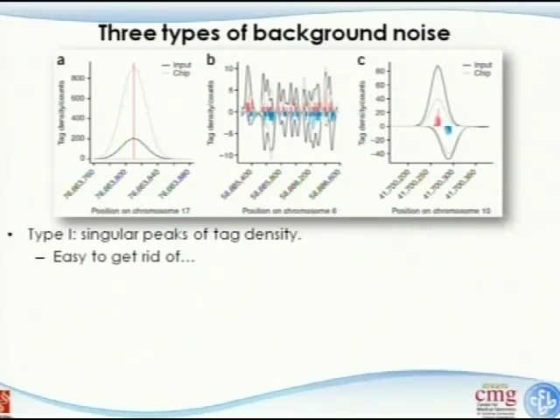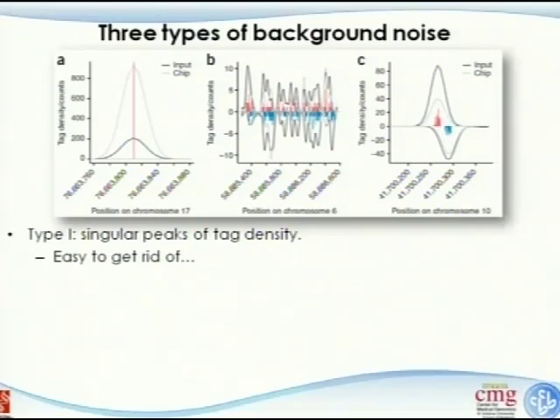There are a couple of different types of background noise. This is a paper by Peter Park's group at Harvard. There are actually two lines in this figure: one is the dark black line, which is the input sample, and another is a faint line, which is the ChIP-enriched sample. The first type of variation is a singular peak of tag density. Their conclusion is this type is pretty easy to get rid of — you see enrichment in the ChIP and also in the input samples, suggesting this region has something weird going on.